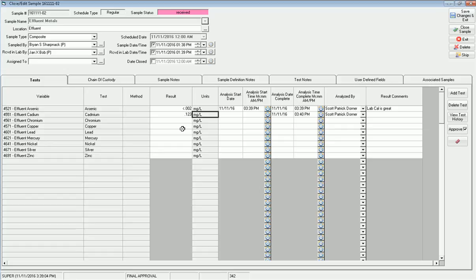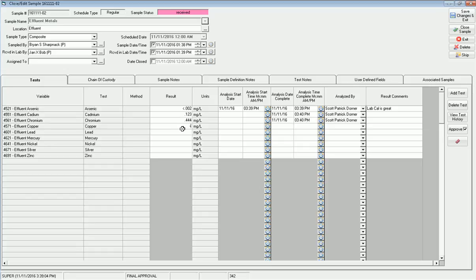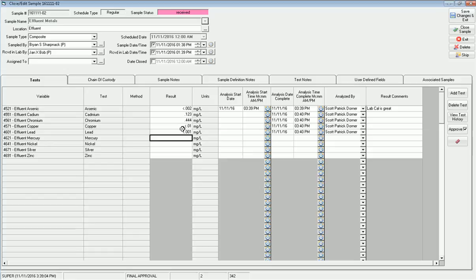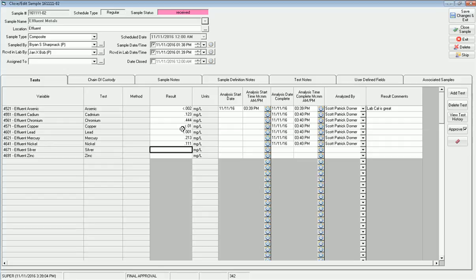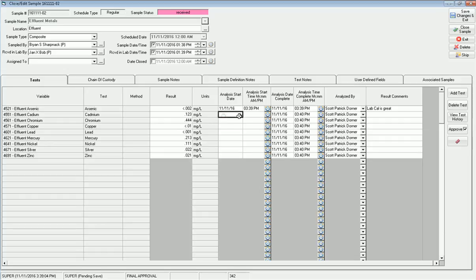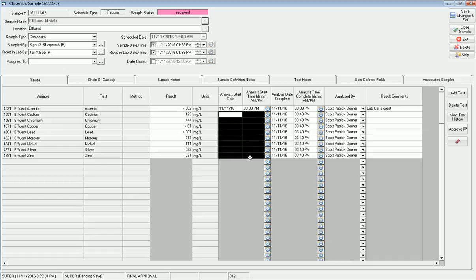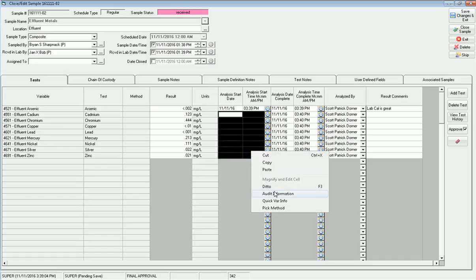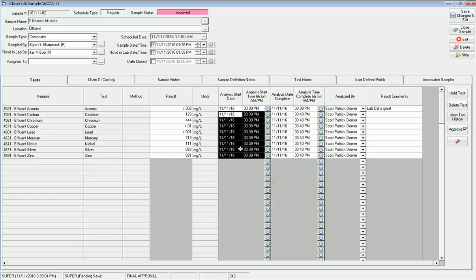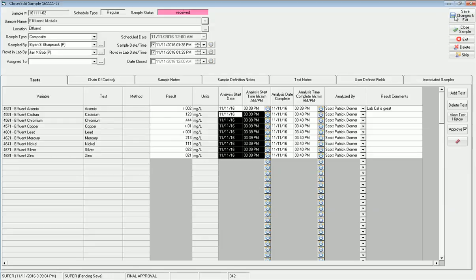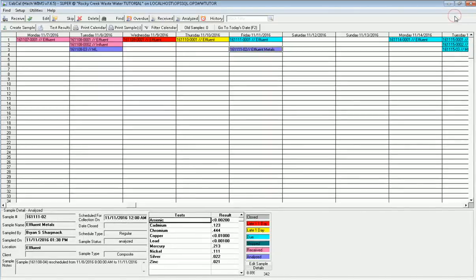Now I can go ahead and enter in the rest of my results. I go to cadmium, let's say it's 0.123. I can go to chromium, it's 0.444. Copper is less than 0.01. Lead is, hopefully, less than 0.001. Mercury is 0.213. Again, I'm just making these results up. Nickel is 0.111, silver is 0.022, and my zinc is 0.021. Now, I can also take all this and right-click. If I do ditto, it just fills in the information and assumes you're doing this analysis all at the same time. This is one way to enter the data in for the sample.